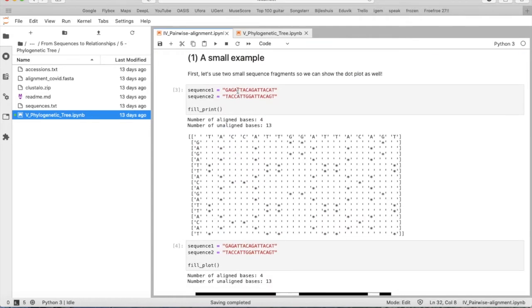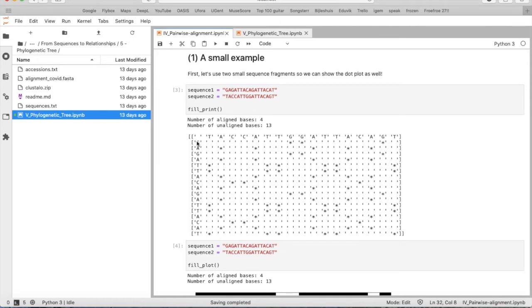So if we look at a small example. I just made two nucleotide sequences, and I say fill_print, so we will align these two sequences. You see here GAGA, that's this one, the vertical one, and TAC, this is the horizontal one.